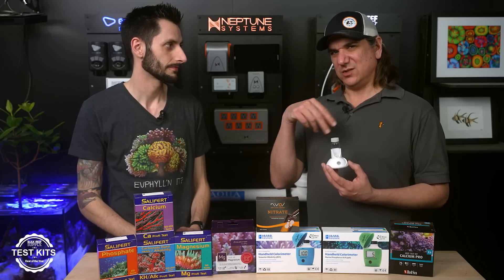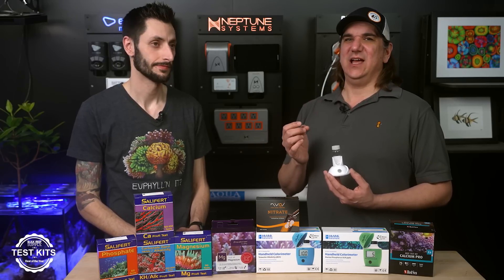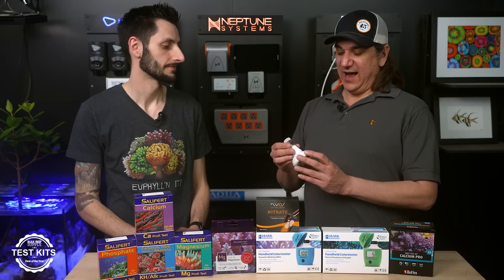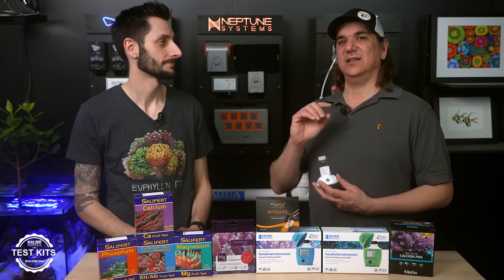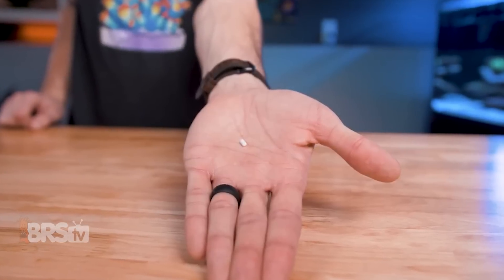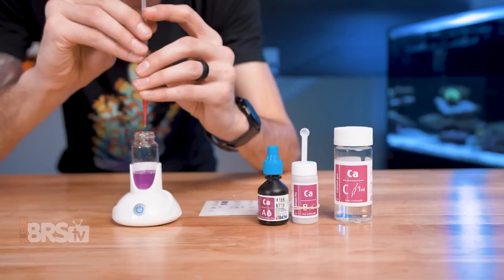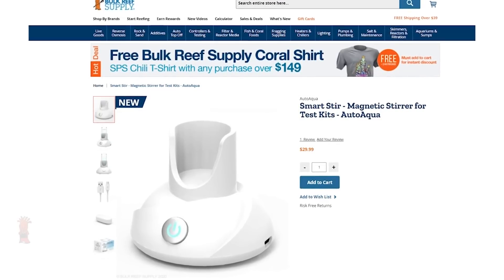This makes the color change super fast and makes focusing on titrating the right amount way easier — you'll do your tests so much faster. The reason titration kits change color is because there's a pH dye in there: when it hits a certain pH, it indicates you've turned enough of the solution from base to acid or vice versa. What you often see is it changes color for a second and changes back, because locally on the outside it turned pink but the inside is still blue. With the Smart Stir's bead mixing everything thoroughly, the moment it changes color, you know that's the right move.